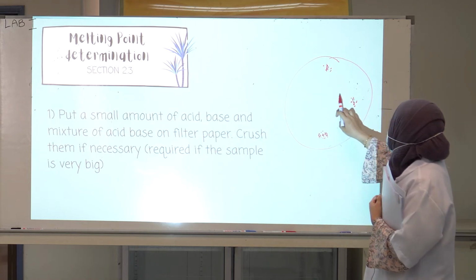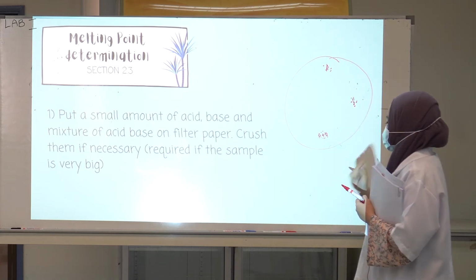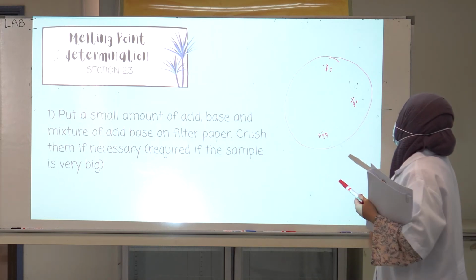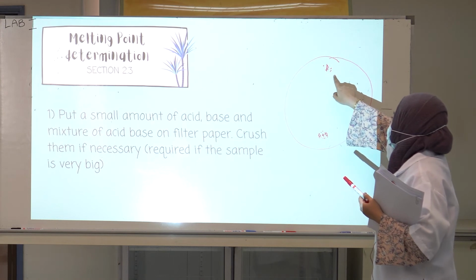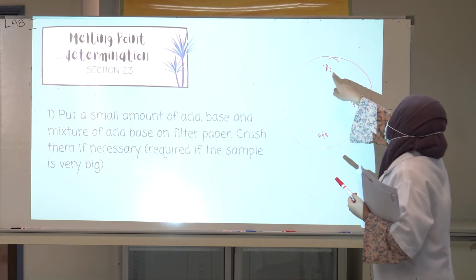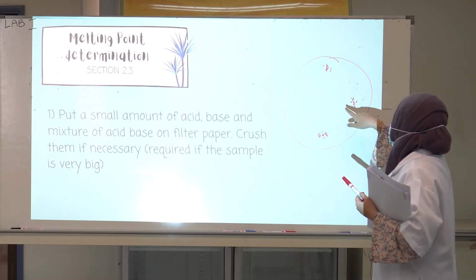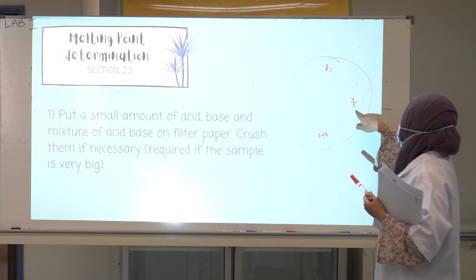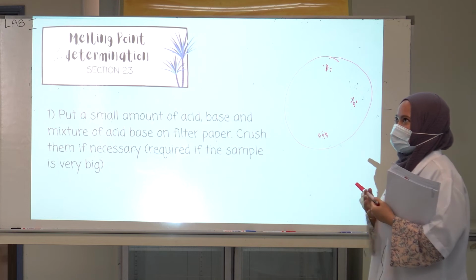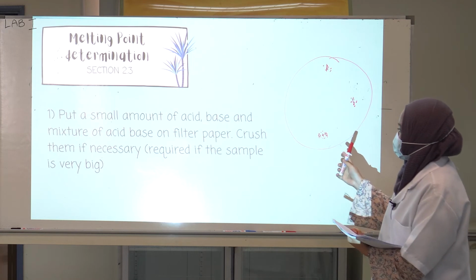While we are doing this, we have to be careful because sometimes the acid powder can mix unintentionally with the base, so we have to do it one by one to avoid that.